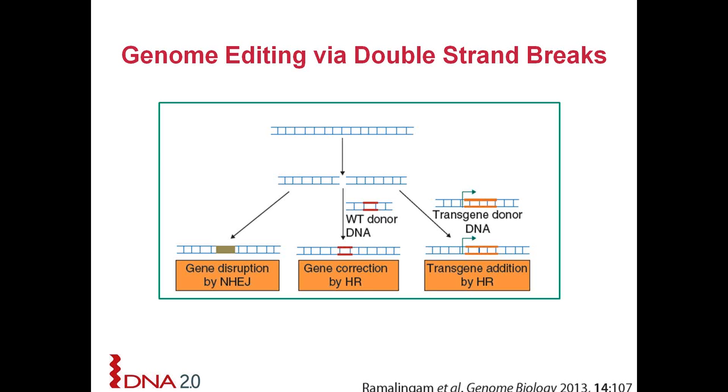Great. Next question is, do you have the lentiviral plasmids that have the CRISPR-Cas9 system in place, since you discussed lentiviral? I will say that we have some plasmids that we are working with here. If you have your favorite that you like to use, we're happy to work in that system as well. The ones we have are in the process of being validated right now, and we're happy to share that information on a one-on-one basis with you. So definitely inquire about that with us.